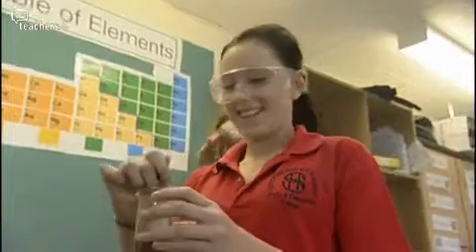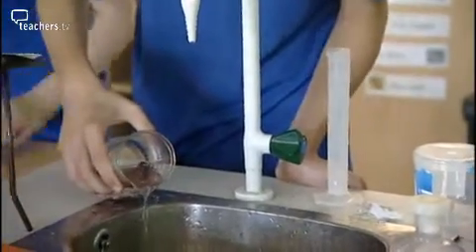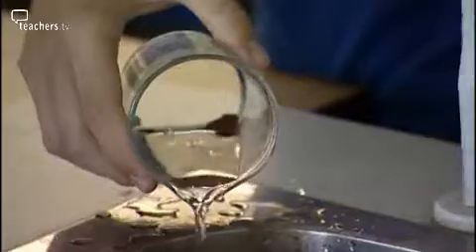This particular reaction between copper oxide and zinc is one that they can really engage with, and because of the amount of energy and smoke that it produces, it's a real winner with the students, and that helps them remember the things that I need them to know about the reactivity series. They can see that they've made this new metal, which is part of our Thermit reaction. Then what I'm going to do is move on to get them to actually isolate it and weigh it, so that we can see actually how much copper we've made.